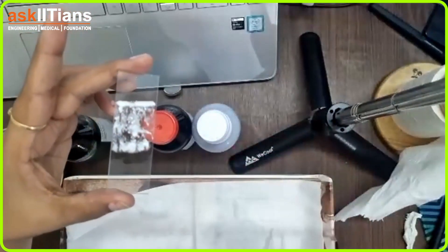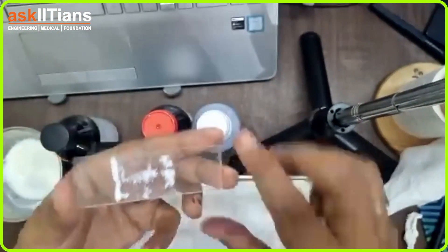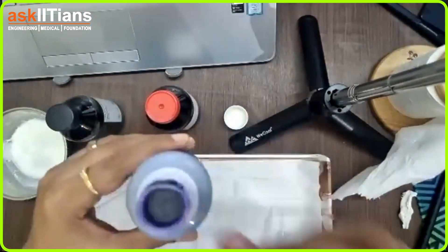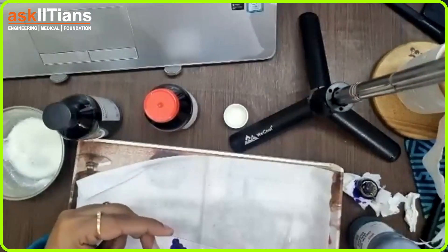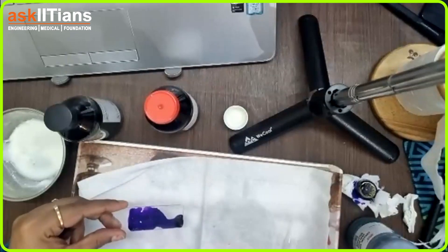Now the next step: I am dropping crystal violet dye over the slide like this, keeping it at a distance so all the bacteria is submerged into it. All the bacteria is submerged, so excess dye I will be throwing off.